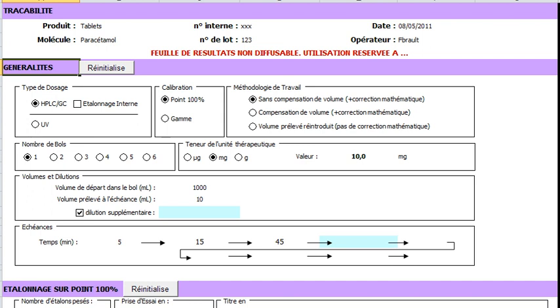Here we select the number of vessels. It can be 1 to 6. The display of the form will be affected, but this is not visible here because it's more in the bottom of the screen.